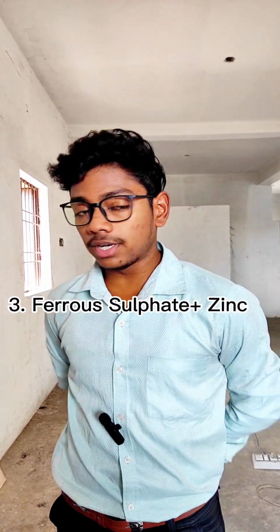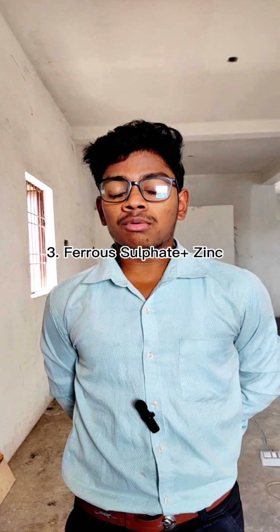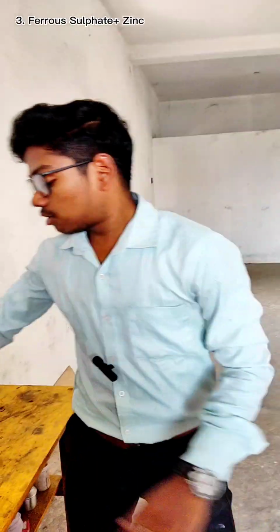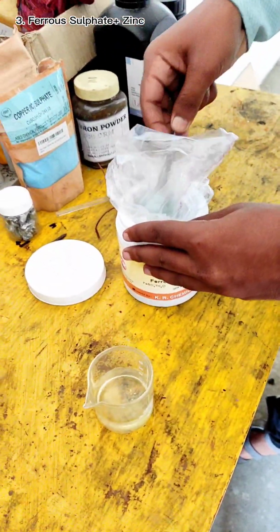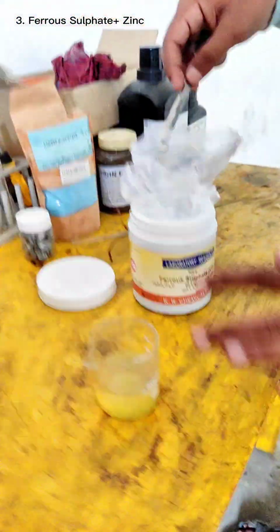We will take ferrous sulphate solution, and then we will add a zinc granule. As we know that zinc is more reactive than ferrous, so it will displace the ferrous from the ferrous sulphate solution. So let's see. First of all, I am taking some amount of ferrous sulphate. This is the color of ferrous sulphate solution.